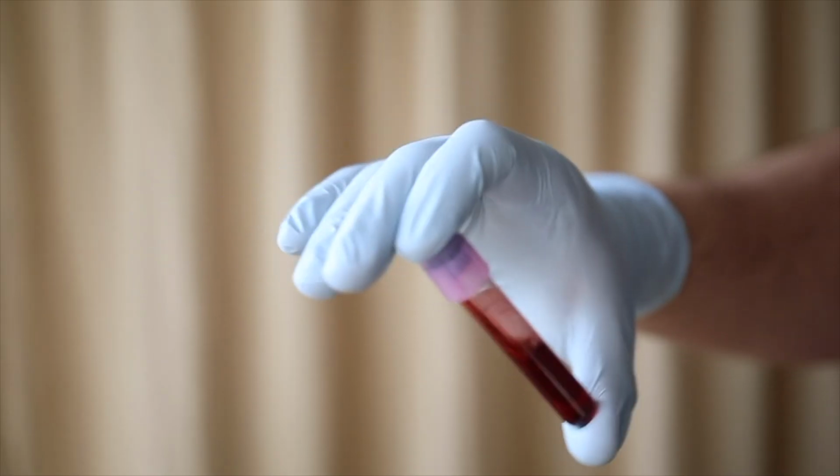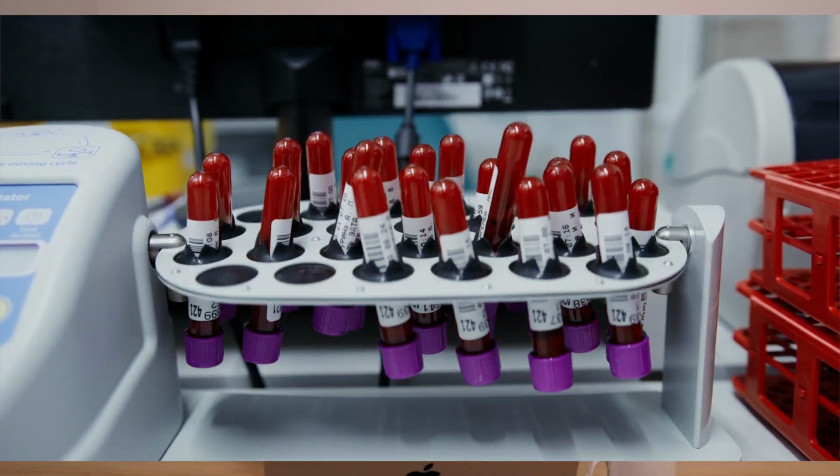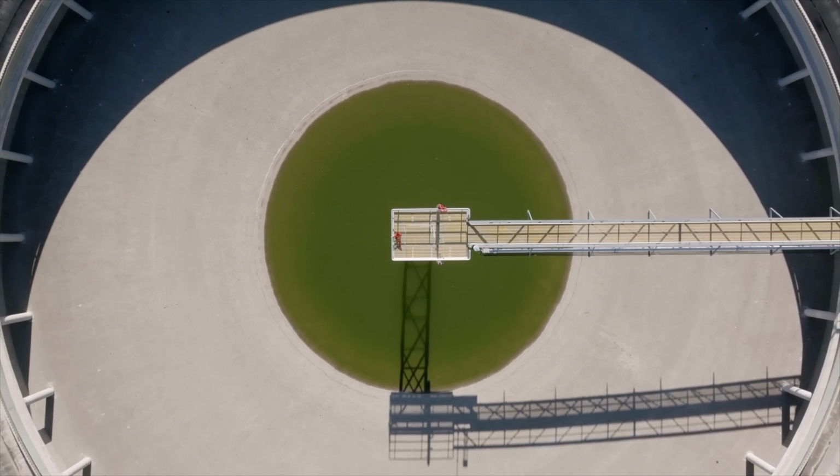Inhibitors can be a problem in nucleic acid amplification and in diagnostic assays and are frequently present in specific types of samples, for example in stool or environmental samples.